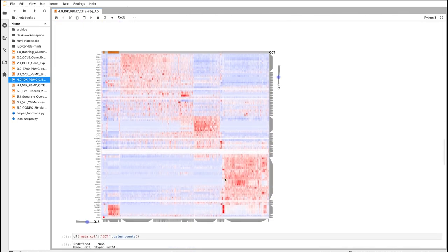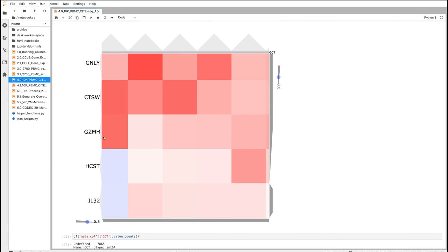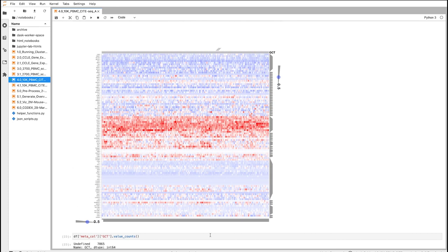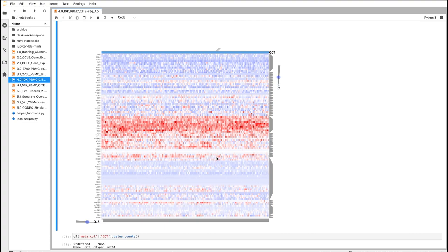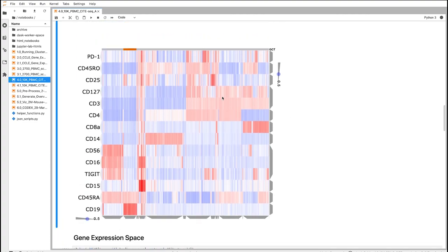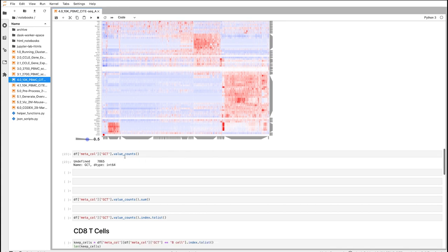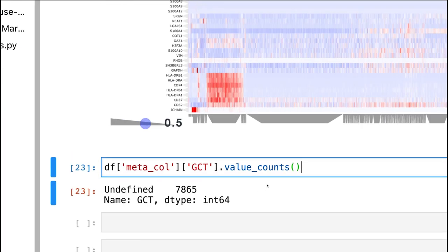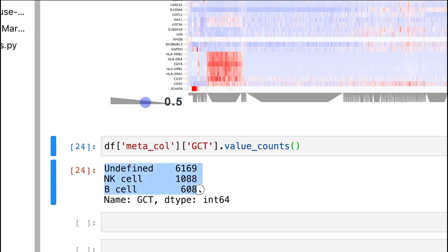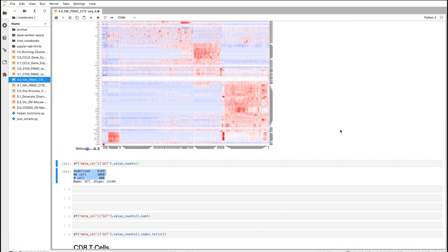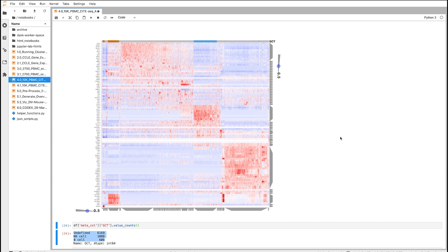We can do the converse and say this cluster of cells is really highly expressing these genes — something like granzyme H — so perhaps these are NK cells. We can type in NK, set the category, and now we've colored them. If you scroll back up, the label has transferred over here. We're linking this up to a single DataFrame of metadata. We start with everything unidentified, and if we re-execute, this DataFrame is actually listening to both heatmaps — two different widgets labeling the same DataFrame. Then we can just go ahead and save this as metadata. We've basically gone through and manually annotated some data, closing the loop on how you can bring in prior knowledge and label your data.